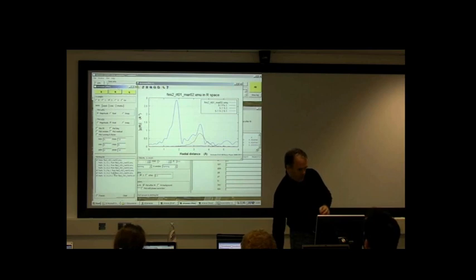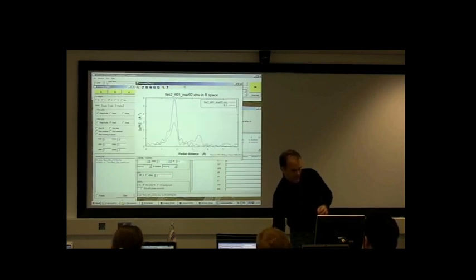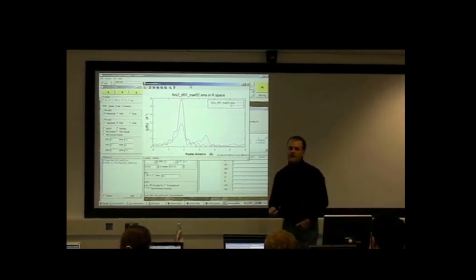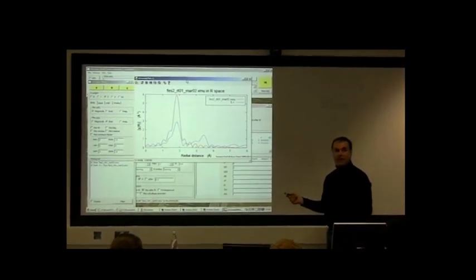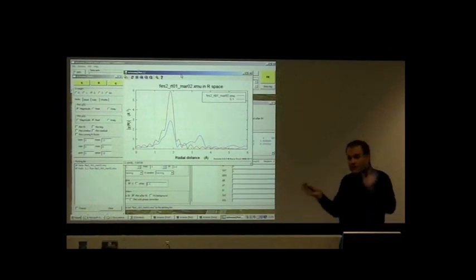let me clear this again and set up the plot I want to look at right now, which is this. We have learned that pretty much the only thing in our FEFF calculation that contributes significant spectral weight to the first peak is the first scattering path. That's useful information. We haven't done a fit, but we already know something about our material.